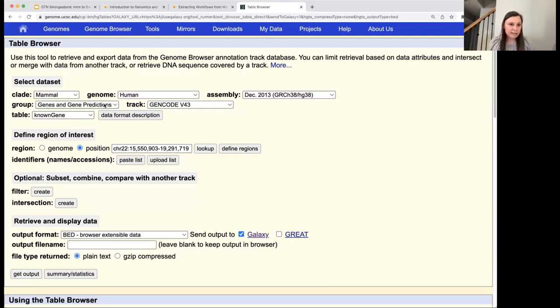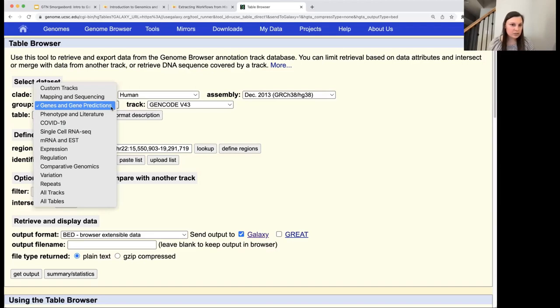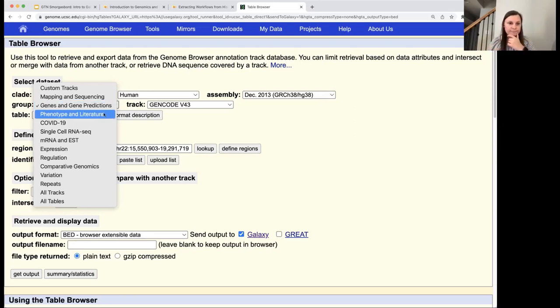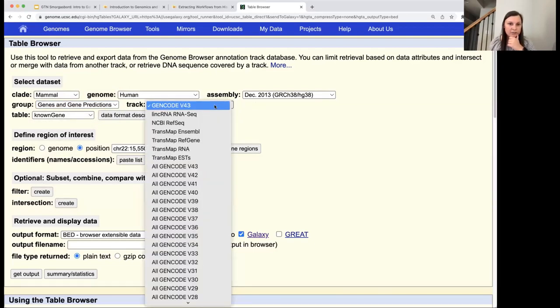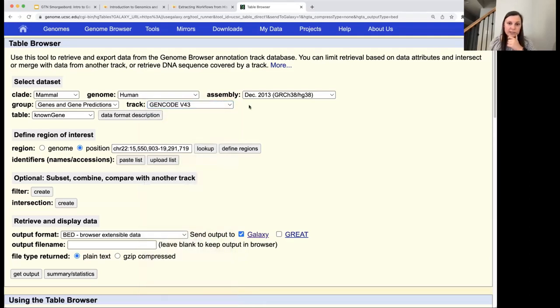For the group, we'll use genes and gene predictions, since that will help us understand which genes are on the forward strand and which are on the reverse strand. We'll use the track GENCODE v43 to get those gene annotations — where the gene starts and ends. We'll use the known gene table.